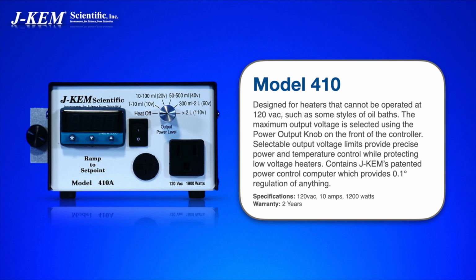There are some types of heaters, such as oil baths, that have voltage limits. They can't be used with a 120 volt controller, for example. Small oil baths might have a voltage limit of 20 or 40 volts. And so we make a Model 410 that regulates low voltage heaters like oil baths.